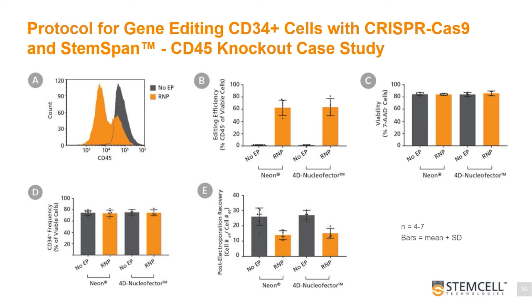And in figure E, post-electroporation cell recovery was negatively impacted by the delivery of RNP complexes containing CD45 gRNA compared to the non-electroporated sample. This is consistent with previous report of delayed HSPC proliferation in response to genome editing with programmable nucleases, including CRISPR-Cas9.